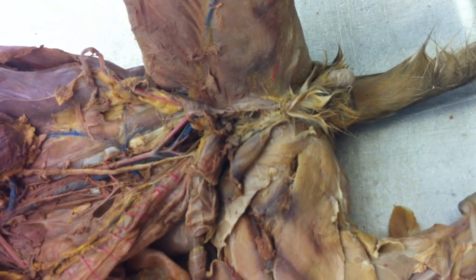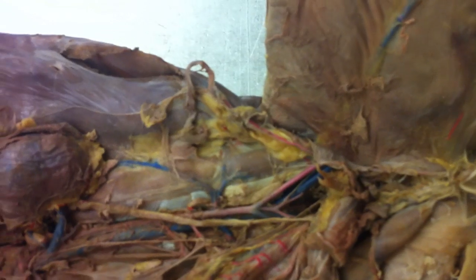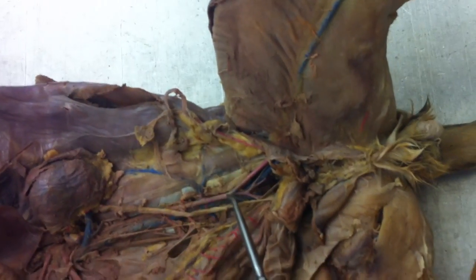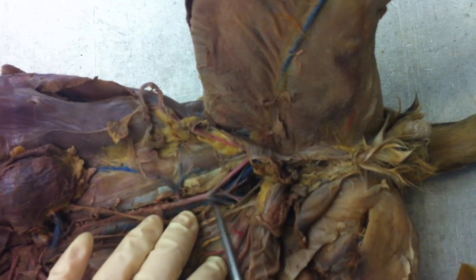So they go back around your hip bone towards the lumbar vertebrae. So they go around the ilium of your os coxae. So we're going to call those the iliolumbar. Just imagine they're going around towards the lumbar, okay? Iliolumbar.